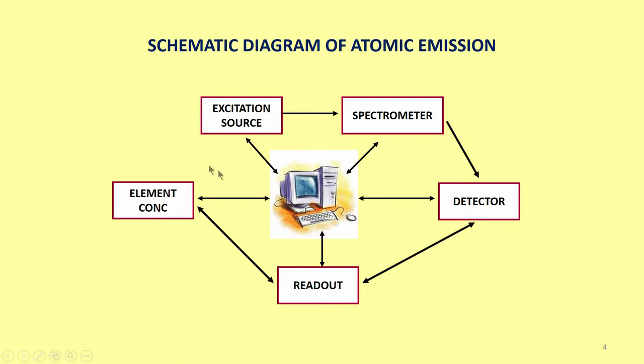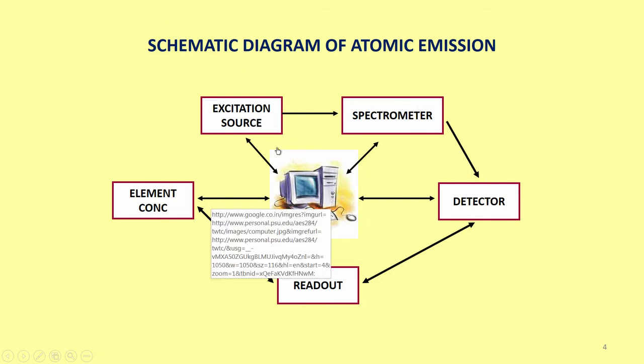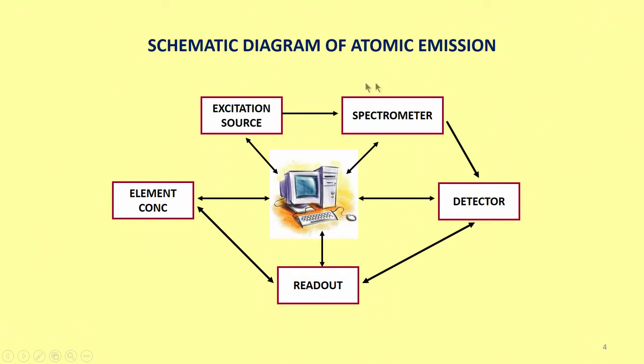So, that is how the different parts of the ICP-AES spectrometer function. These are their functions, and all these functions are connected or correlated using a centralized computer. Nowadays a desktop computer will do that job. Earlier they used to be dedicated instruments, something like a black box. Nowadays everything is becoming simpler.